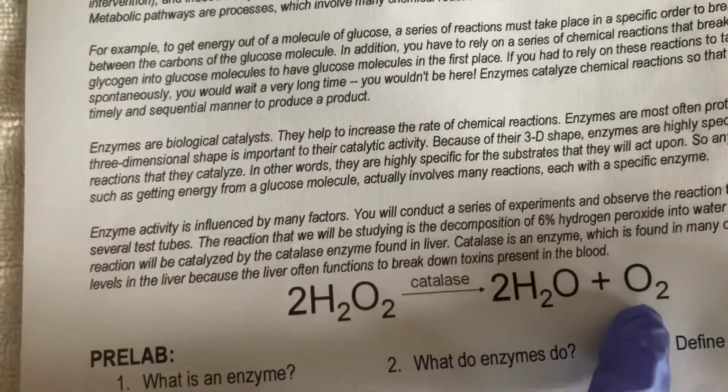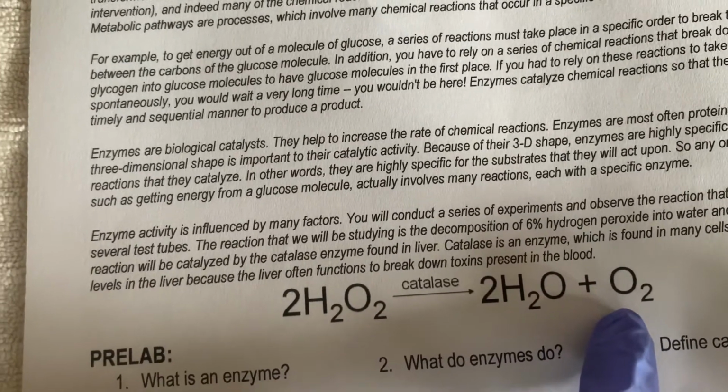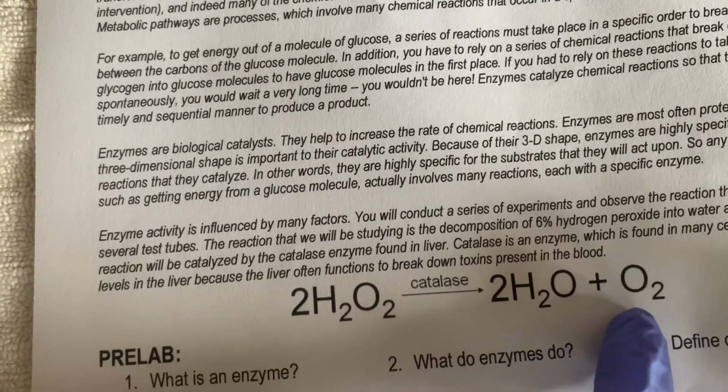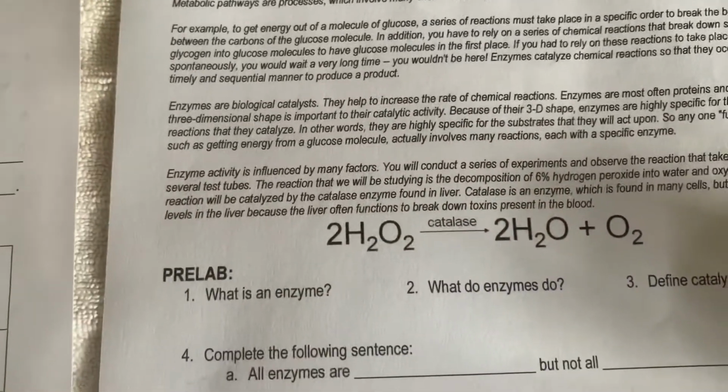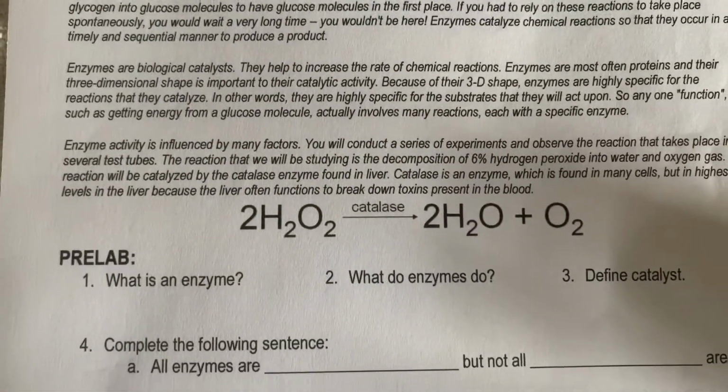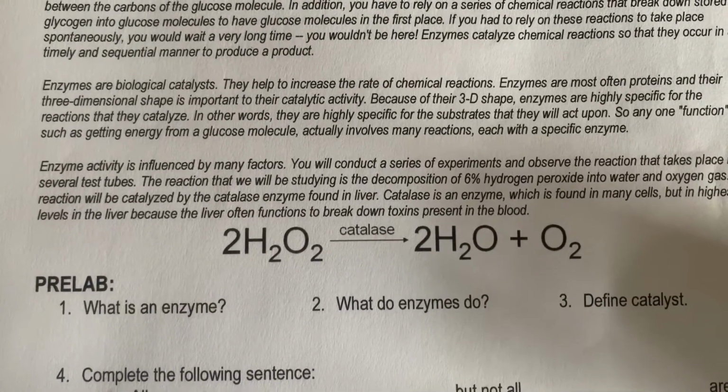And so if it does that, then when you add the hydrogen peroxide to the liver, you should see lots of bubbling.